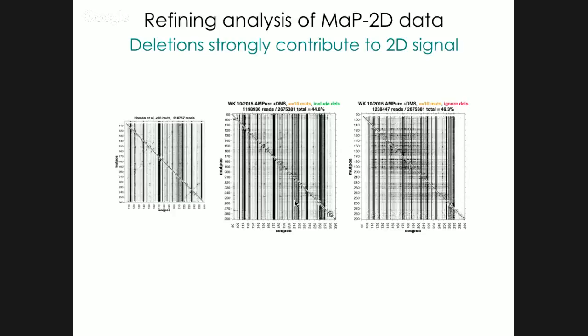Then given this result, we wanted to see whether we could potentially reduce the number of deletions that were occurring in assembling the DNA template by doing PCR from plasmids, which already include the full-length sequence of the template, so they don't require bridging between separate oligonucleotides to make the full-length DNA.